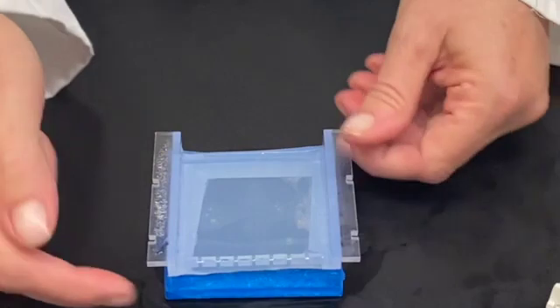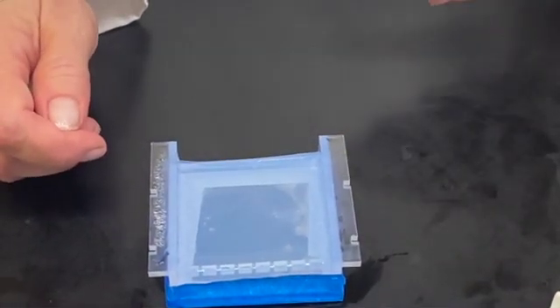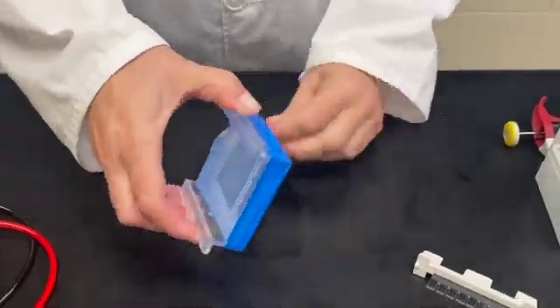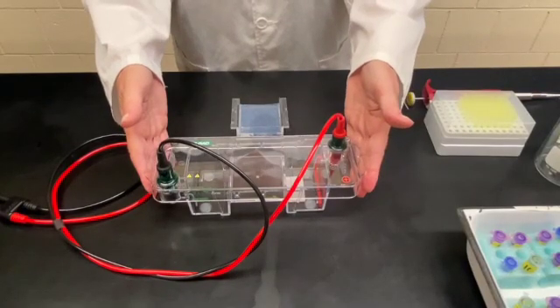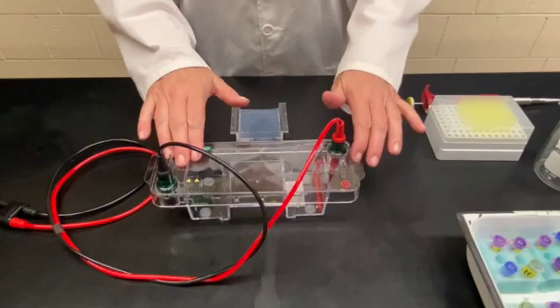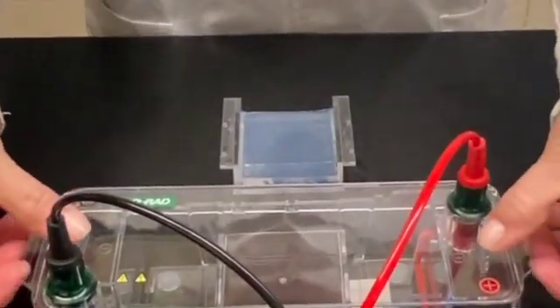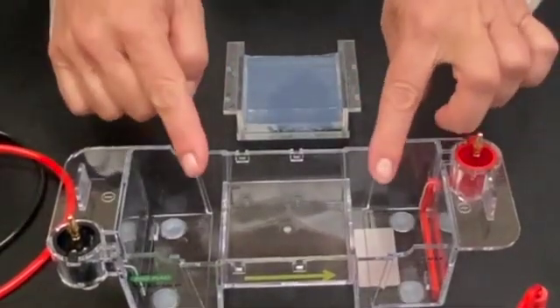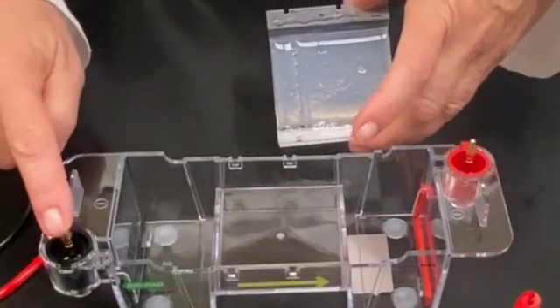The next thing that I'm going to do is remove this tape because we want the electricity to be able to run through the gel really easily. This is a gel box or an electrophoresis box and it has a lid on it. We're going to take the lid off by pushing on these pegs with my thumbs and just lifting up, and we're going to put that to the side. The next thing is to put the gel in the gel box, and the wells from the gel should be on the black side of the electrode.